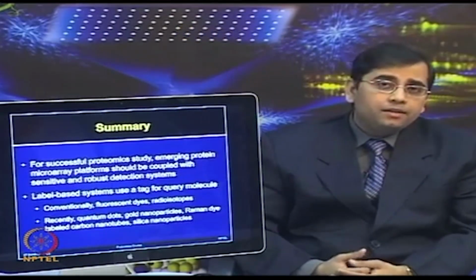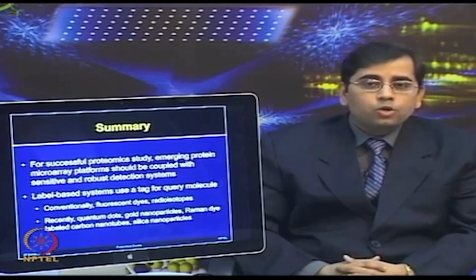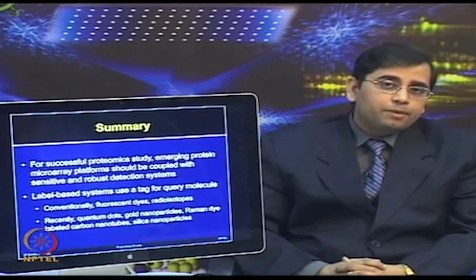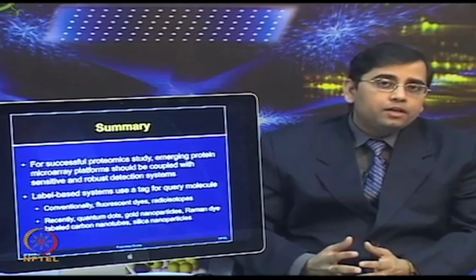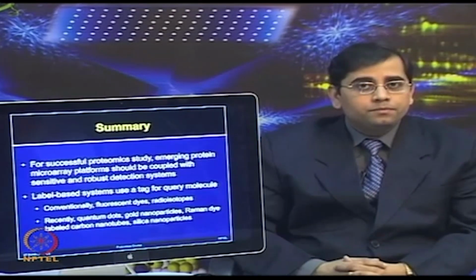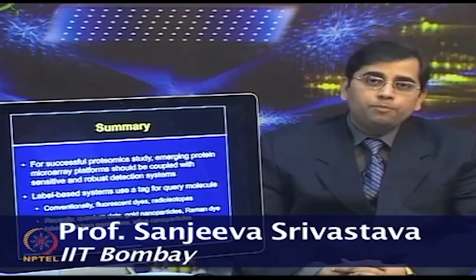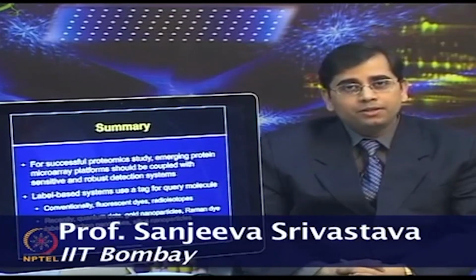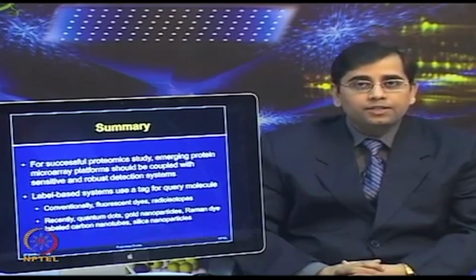But recently, nanotechnique based systems such as quantum dots, gold nanoparticles, Raman dye based systems, SERS based dyes, and silica nanoparticles have started integrating with the microarray platform. So, we will continue our discussion about detection techniques which are employed for protein microarrays as well as other proteomics applications in our next lecture, and then we will talk about label free detection systems.